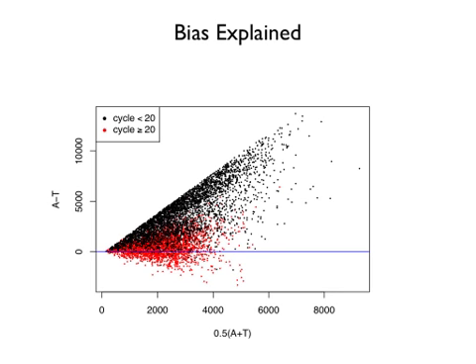We know this is supposed to be an A. That's what it's supposed to be. So at the lower cycles, the A is in fact higher than the T. That's why it's above 0. Almost all of them. There's a few exceptions, but they're almost all correct. But as the cycles become higher, all of a sudden that sensitivity is lost, and now we have this red mesh. So you can see how we will make a lot of mistakes. All these below 0 are going to be called T's, because the T is bigger than the A.